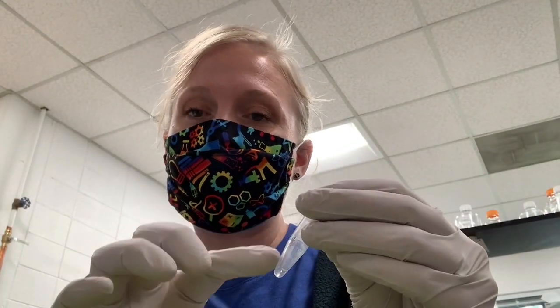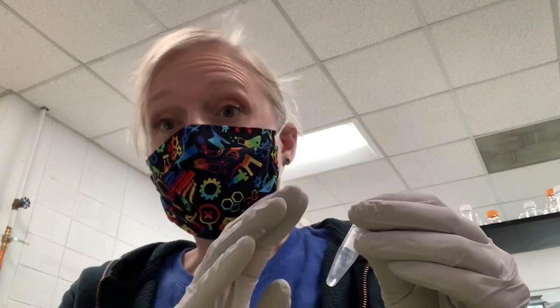Okay, so I finished with the annealing process. I've taken my tubes out and spun them again in the centrifuge to make sure all the liquid and condensation, which can happen during the heating process, gets back down to the bottom. So I have my purified double-stranded RNA here. The next step is to run this sample out on a gel. And I've made another video of pouring and running agarose gel, so I'm just going to tell you what I do differently for double-stranded RNA than what you saw in that video.